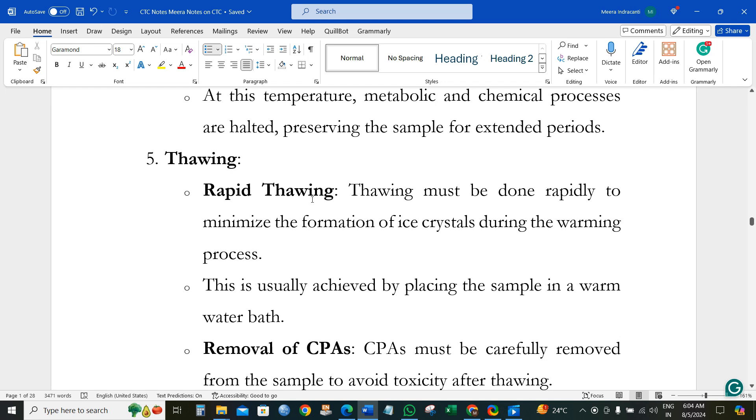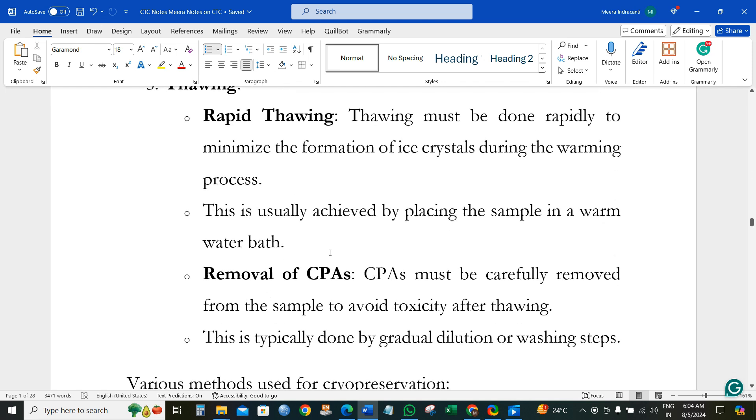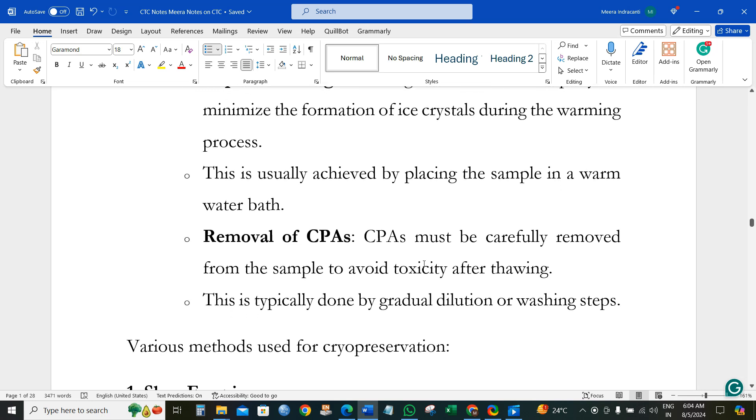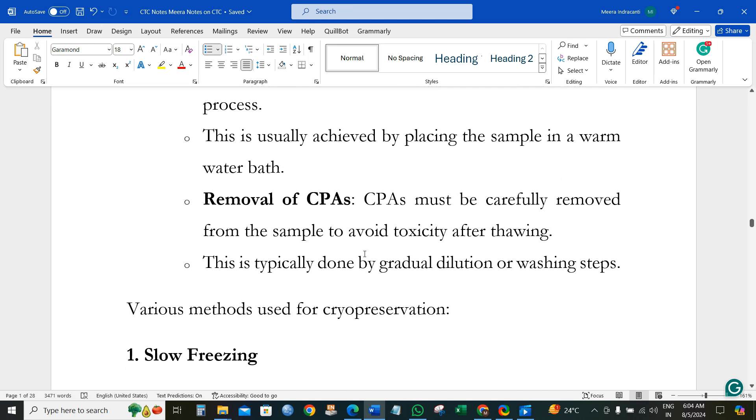We rapidly bring the sample to room temperature. Rapid thawing is mostly done to minimize crystal formation during the warming process, from minus 196 to room temperature. We use a warm water bath to maintain the required temperature. After bringing to room temperature, we remove the cryopreservative agents so the cells will not be toxic, and we can use the cells for normal processes.